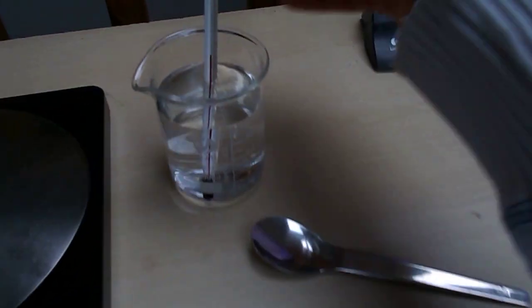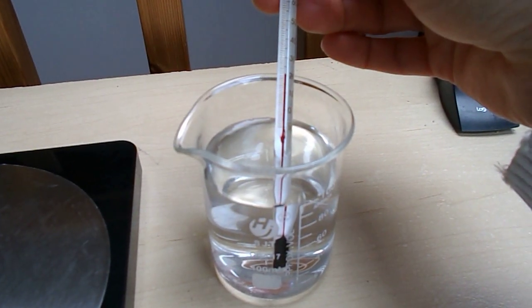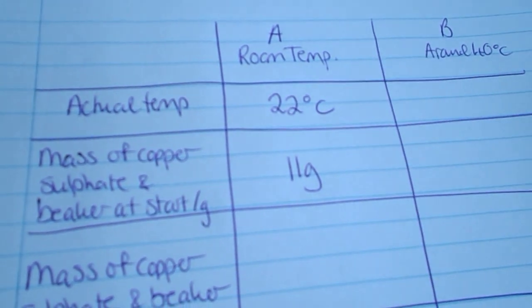While I'm here, I'll go back up and check the thermometer. So the thermometer is reading 22 degrees. So our room temperature today is going to be 22 degrees C.